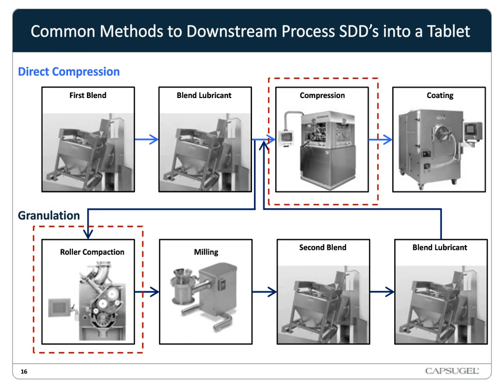The other option is a granulation option where the SDD is granulated. Dry granulation is something that we prefer in our experience. And this is because it attenuates any changes in SDD properties due to natural variation of the process and the raw materials. However, the process train that is selected generally depends on the density of the SDD and depends, of course, on the dose as well.